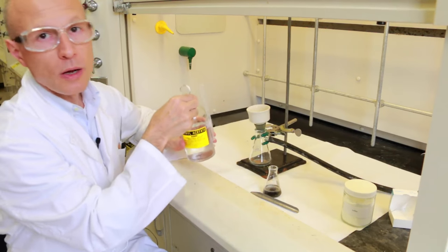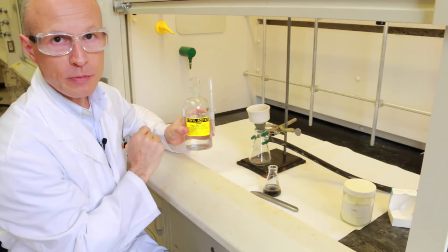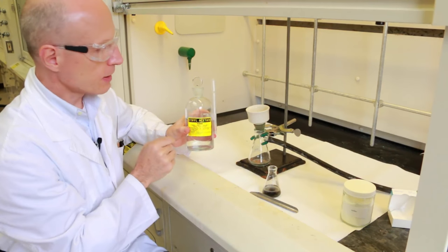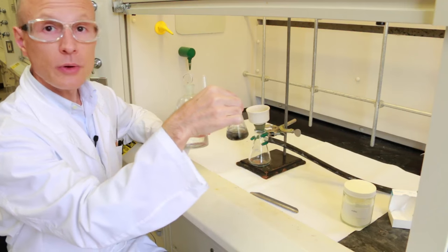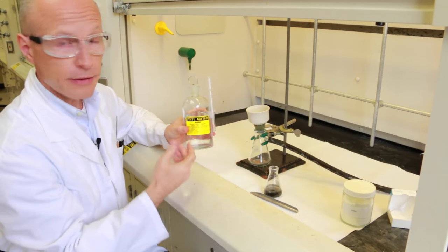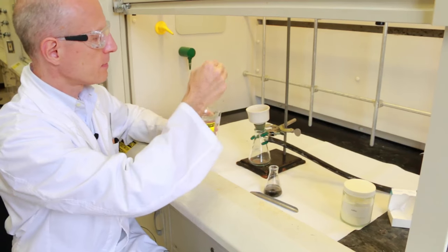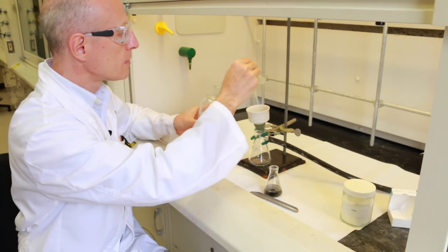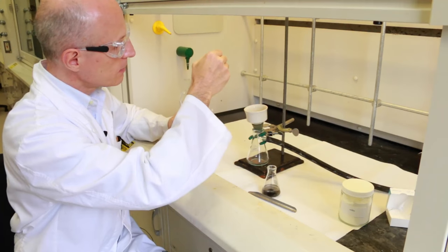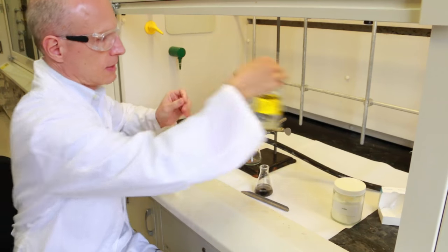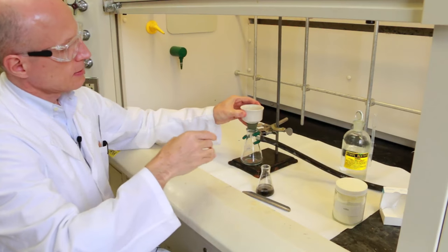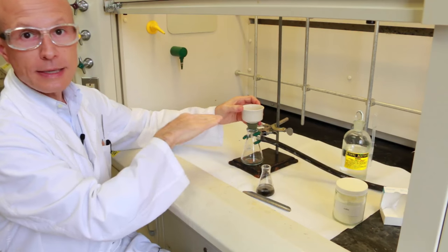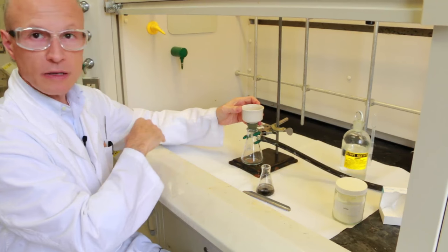As usual, you want to wet the filter paper before you start filtering. You use the same solvent that you have in your solution. In my case it's ethyl acetate, so I will use ethyl acetate. Now your filter is nicely stuck to the bottom of the funnel.